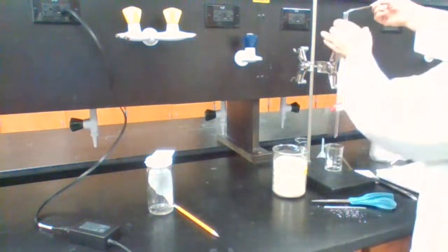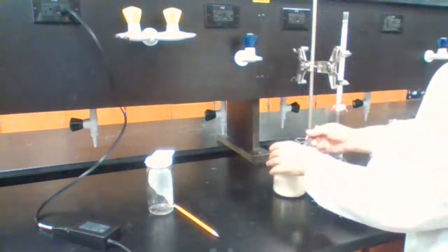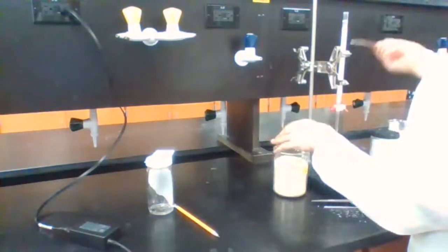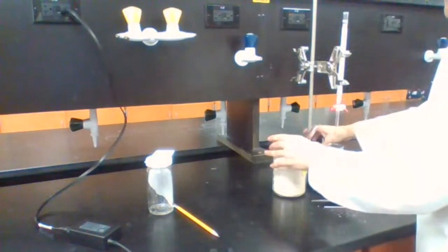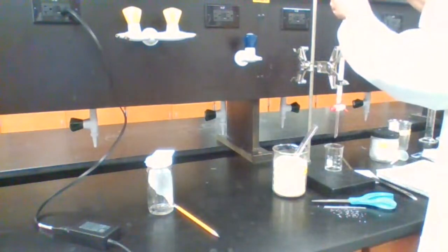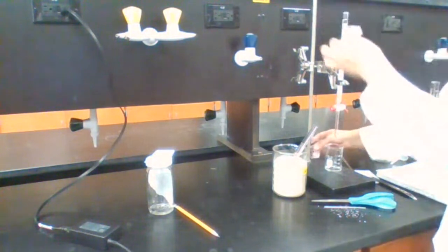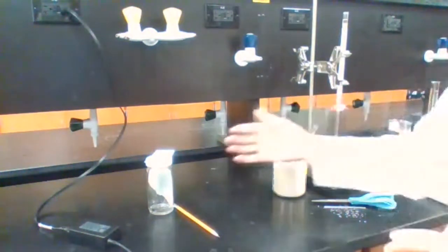Last part, adding sand. Making sure this is okay. The column is ready. This is just preparing the column.